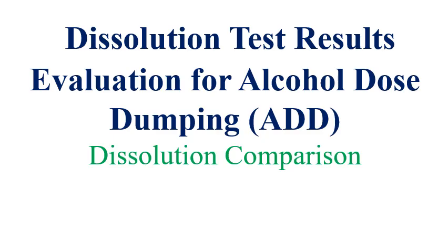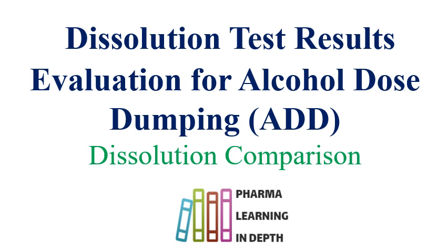I hope this video will help you to understand alcohol induced dose dumping, dissolution testing for alcohol induced dose dumping, and the comparison between the US and EU requirements.